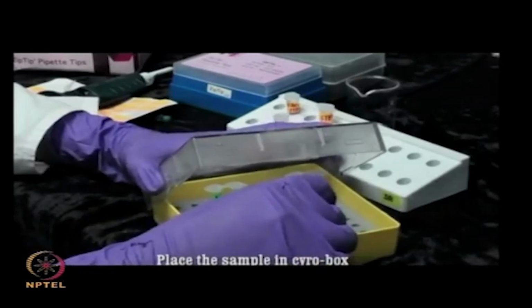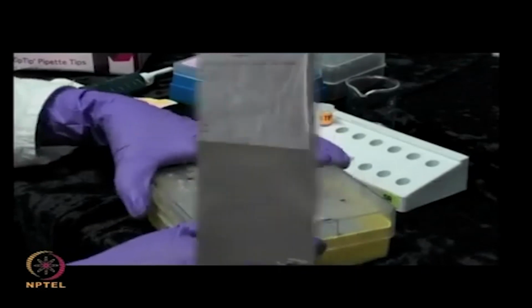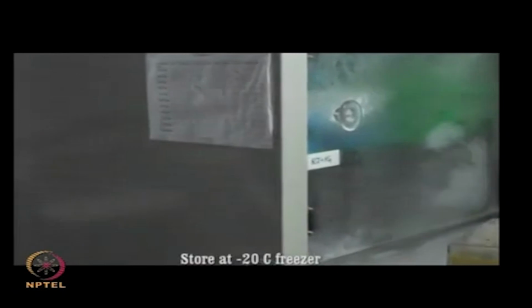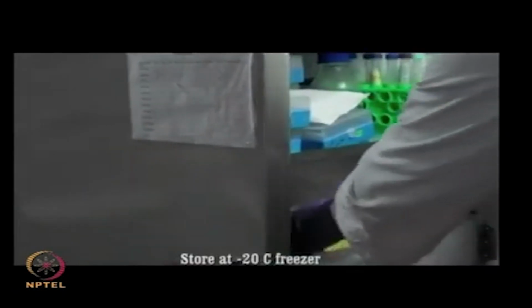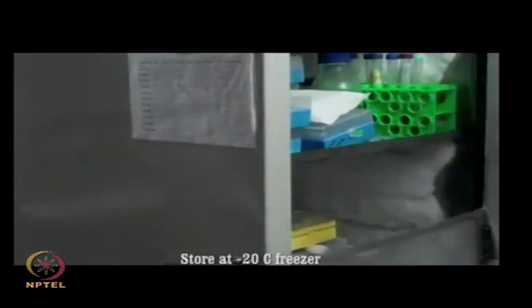After the elution is done, you can keep these processed samples in cryo boxes and store them in minus 20 degrees centigrade freezers. The in-gel digested samples which have been processed by using ZipTips can be further analyzed by using mass spectrometry.